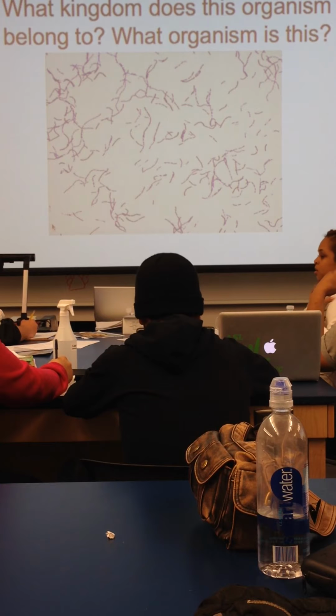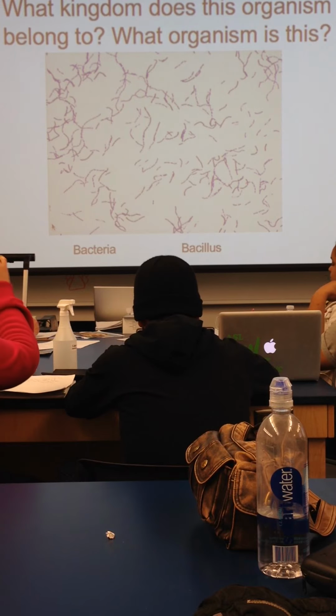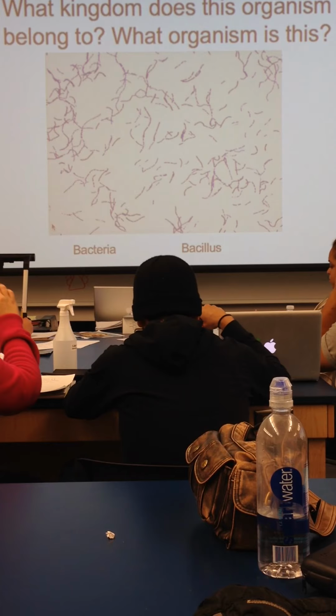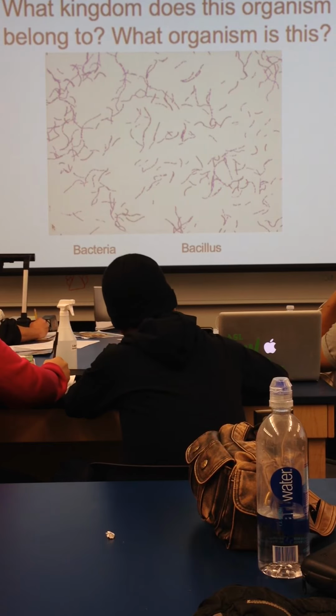All right. So, what organism is this and what kingdom does it belong to? Bacteria, yes, Stephen, and what shape is it? It's the rod-like, so we need to know that rod is bacillus, yes. Okay? Rod-like. So don't get confused, guys, because some of these do look a little squiggly, but what you're actually looking at are the individual cells, which are rectangular. Okay, so this is your rod-like or bacillus bacteria. So this is one of those scientific terms you need to know. Bacillus is rod.